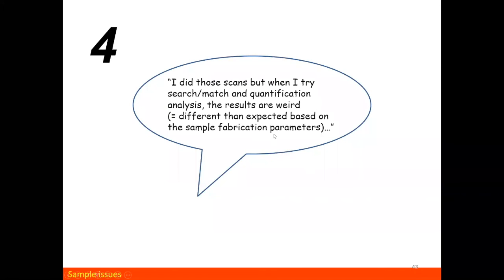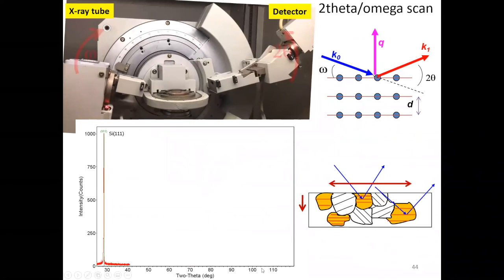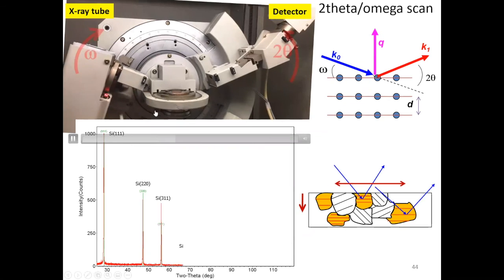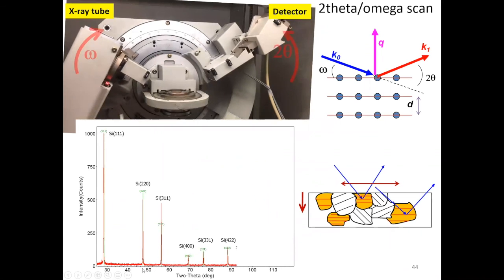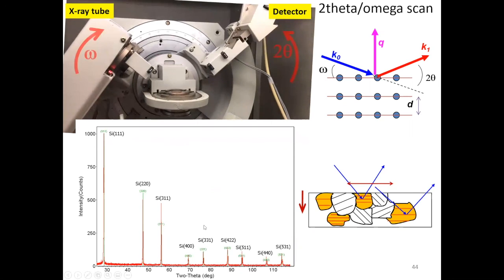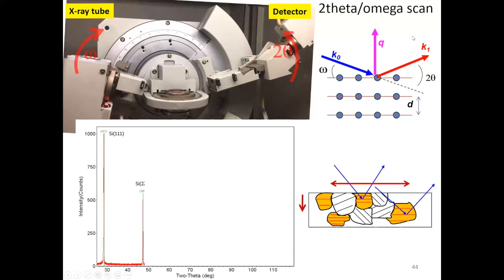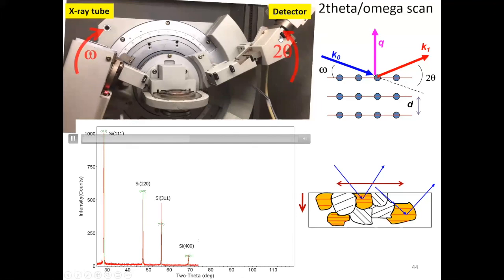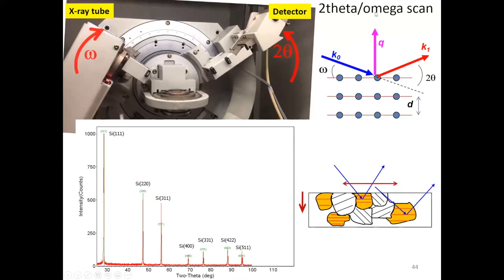But please look on the right-hand side. This is important. Number one, as you change the angle of incidence and the angle of the detector, you are changing the angles of the wave vectors, which means that you are probing the scattering vector Q along a particular direction, which is always normal to the planes, and most of the time perpendicular to the surface. Well, in a nutshell, you are only probing the orientations that are parallel to the surface. You can see that here on this colorful diagram, where in doing a measurement you are just probing the grains or crystallites that have orientation parallel to the surface. And then you ask, well, how about the other ones?